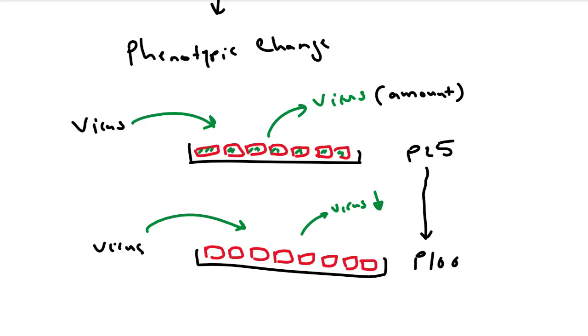So at the point where my positive control stops working, or stops working at the level that it was working before, that means that I have a range within those passage numbers. Let's say it works normally from passage 25 to passage 40. That means that from passage 25 to passage 40, this system is working fine. After passage 40, the phenotype of the cells change, and they're not getting infected at the same level they were before.